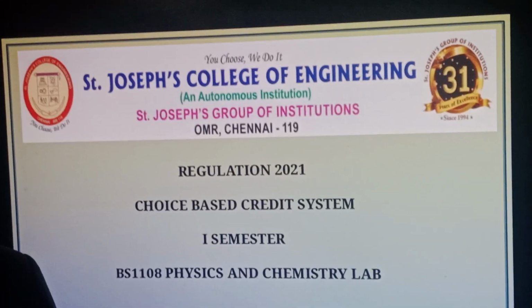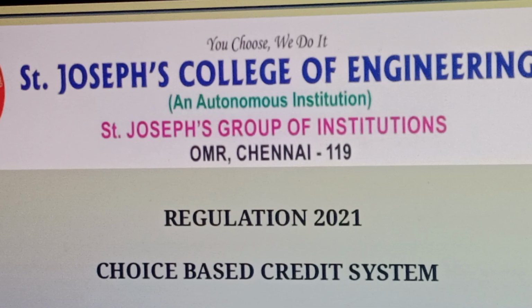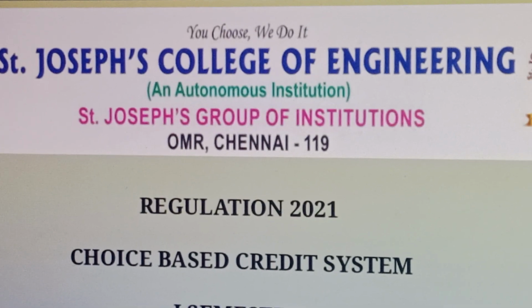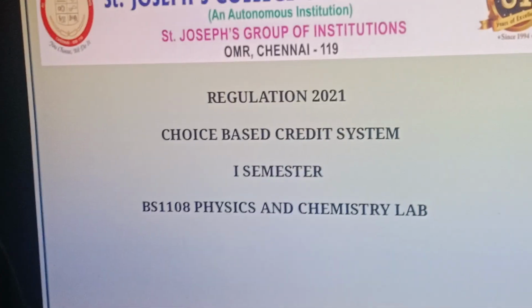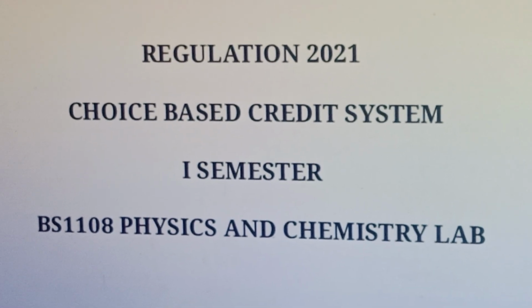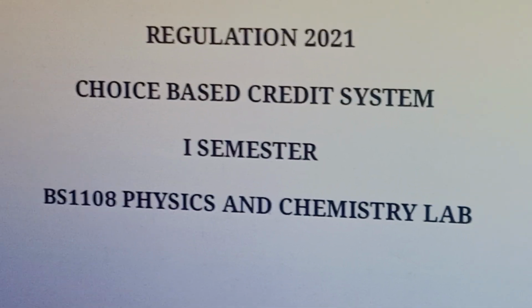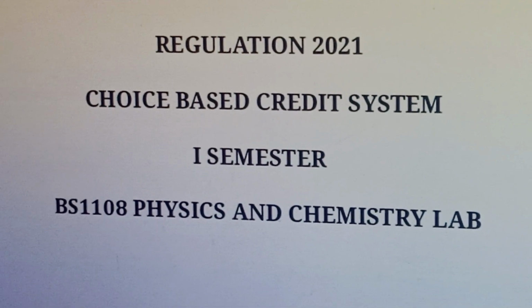In this lab, we will be performing a set of physics and chemistry experiments that are essential to understand the fundamentals of science through hands-on practice. We will explore a variety of experiments that connect theory with practical knowledge. You will learn how to handle instruments, carry out titration, and understand chemical properties and reactions through hands-on work. We will be doing 6 experiments as per the syllabus, but I will explain the major 5 today so that you can understand the aim, principle, and simple steps for each one.